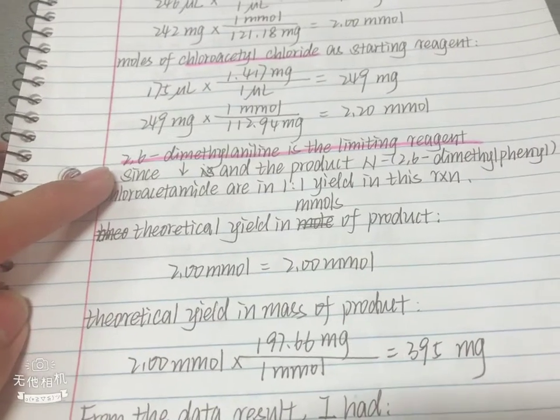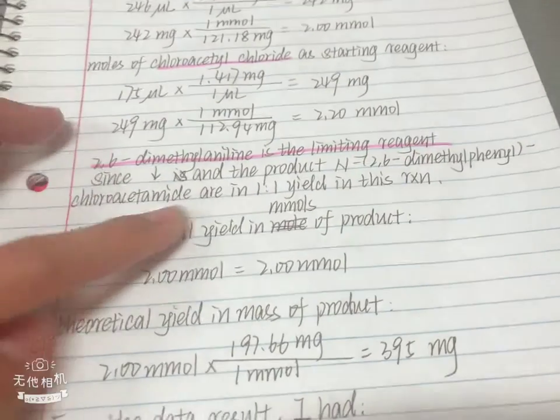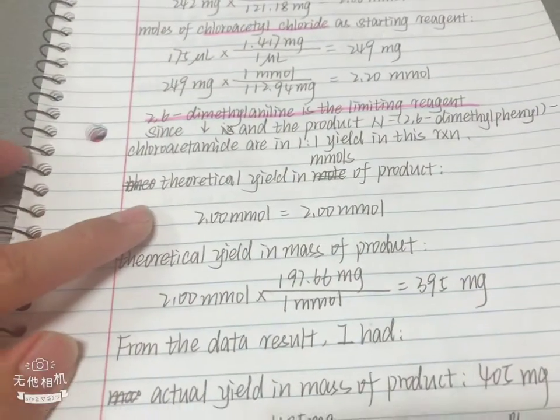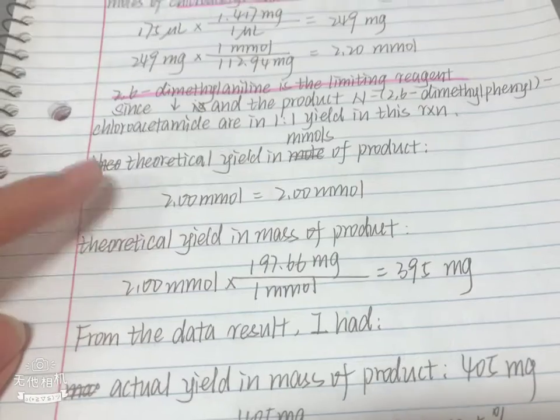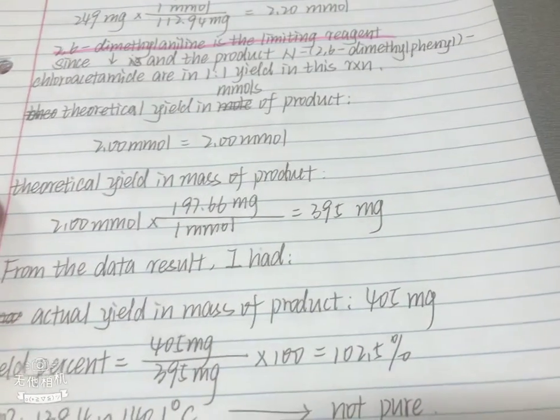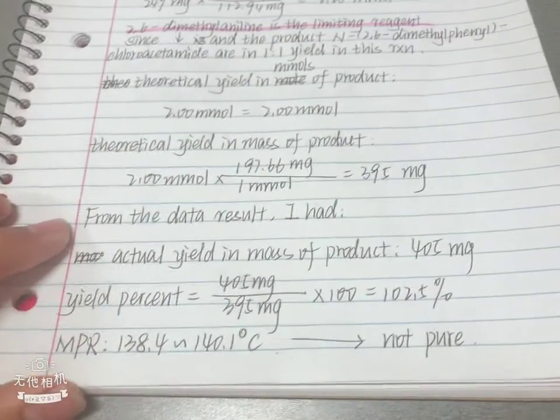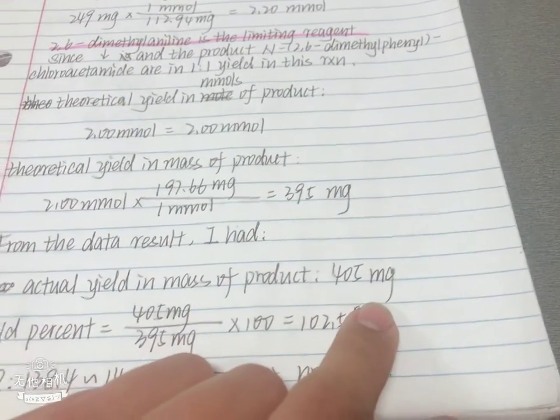As we know, since 2,6-dimethylaniline, the starting material and the limiting reagent, has a 1:1 ratio with the product N-2,6-dimethylphenylchloroacetamide, we can say the theoretical yield in millimoles of the product is 2.00 millimoles, the same as the starting reagent. Then we calculated the theoretical yield in mass of the product to be 395 milligrams, so we would expect to have 395 milligrams of product. But from the product I got, I found that I actually have 405 milligrams.